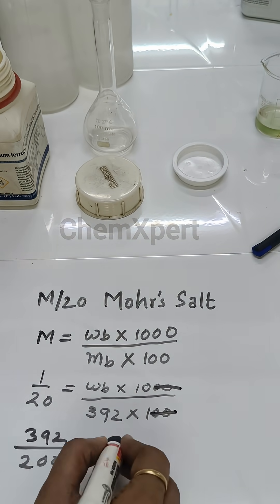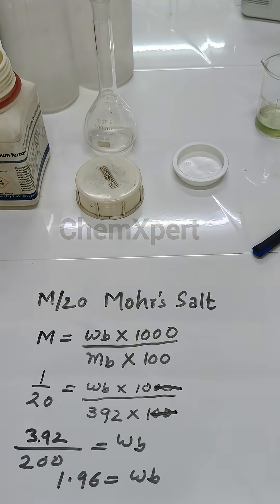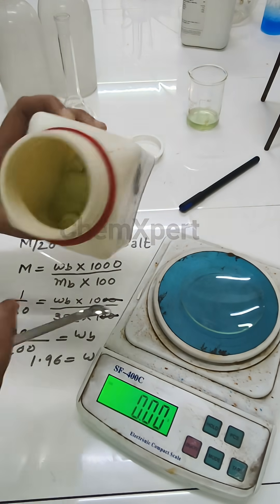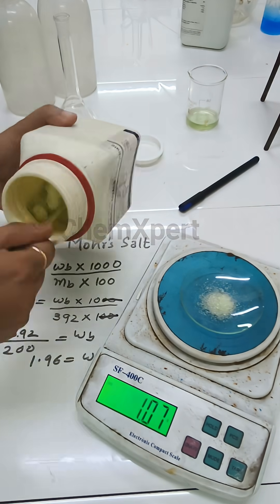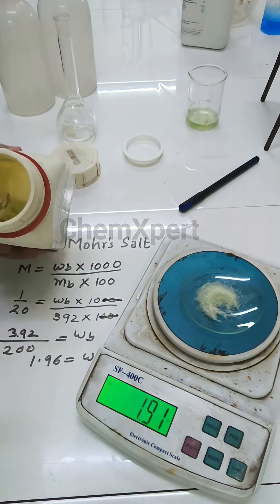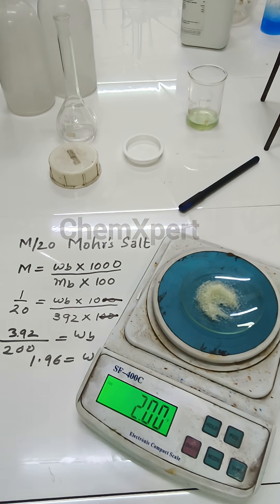On solving this we get the answer here, 1.96 grams. Take the electrical balance. First of all, tare it by making the reading 0 here. Then add Mohr salt and we have to weigh till 1.96 grams. Again adding it, and then we get the perfect reading here, 1.96.